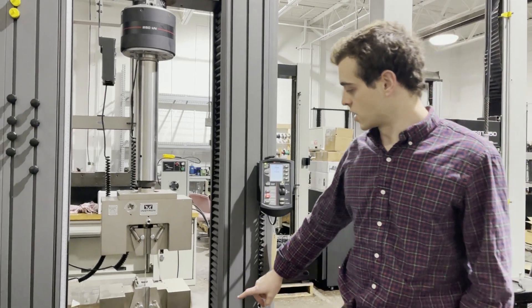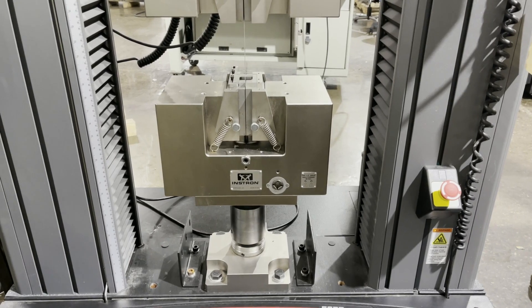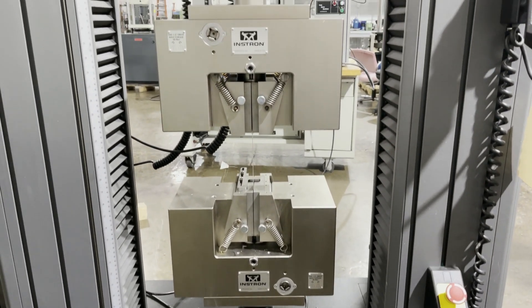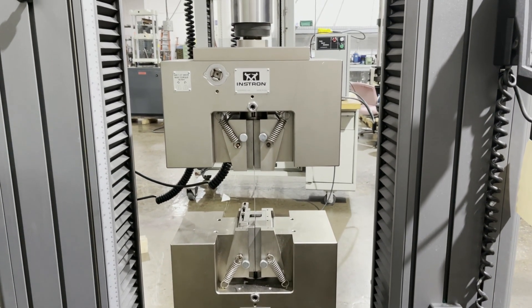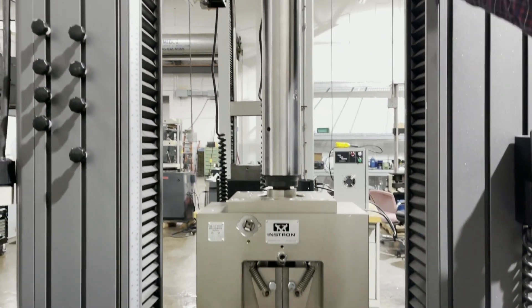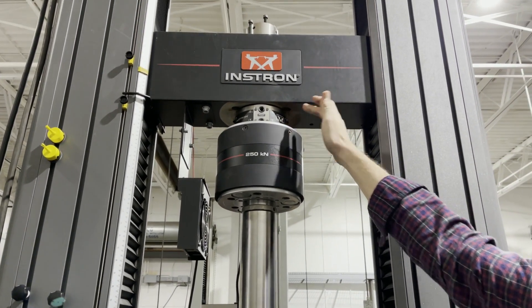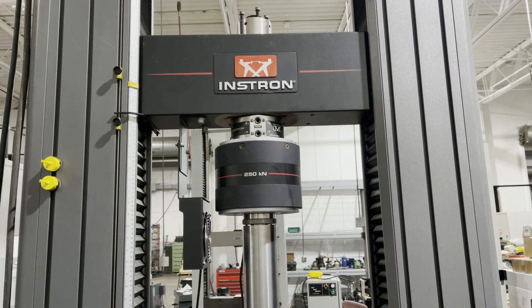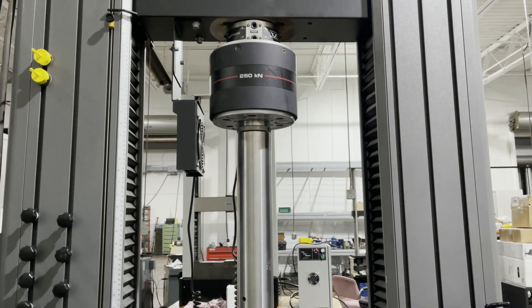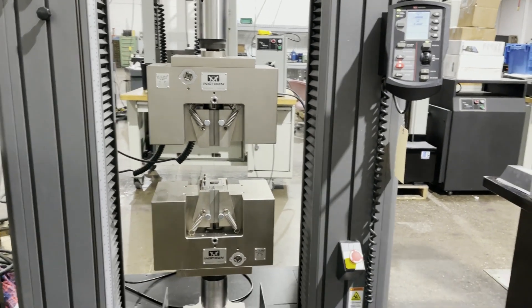We'll walk through some of it. We have a nice 250 kN grips — original Instrons — and those will come with a couple different types of faces. There are currently flats in there, along with a 250 kN Instron load cell and an alignment fixture that falls within ASTM E1012.